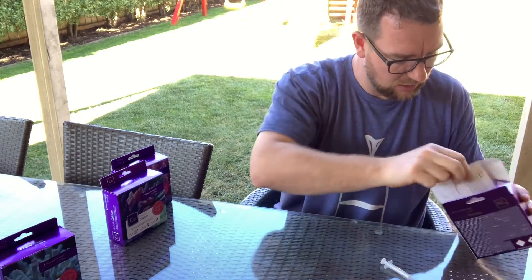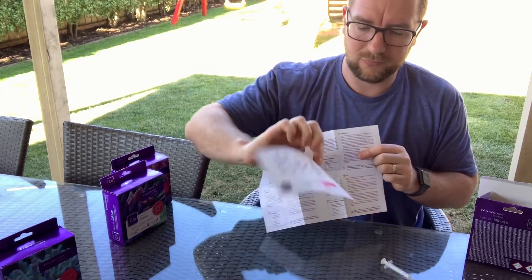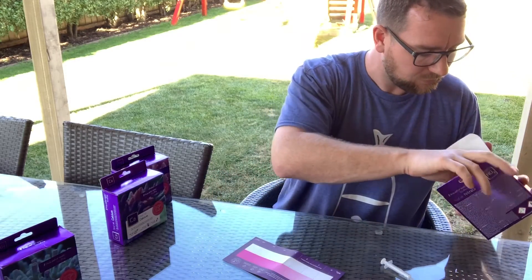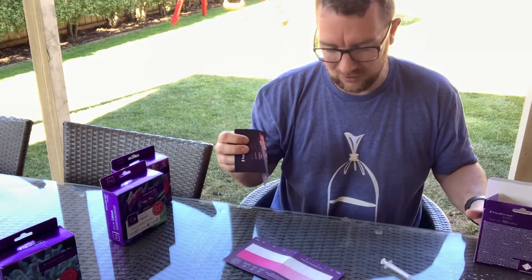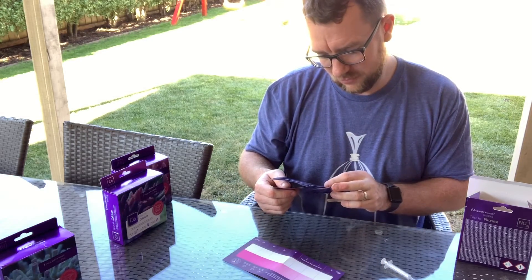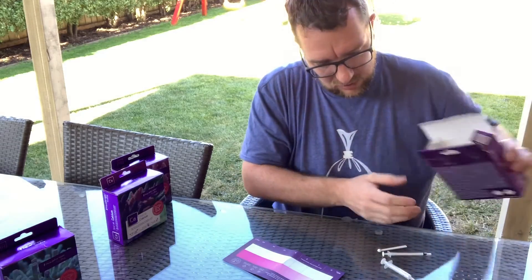We also get some paraphernalia — full written instructions, though I'll just use the handy card. There's also a little spiel about their NitroPhosMinusMinus product, which is kind of ironic since it's a nitrate test kit. So if you're struggling with nitrate, you can dose NitrophosMinus, and there are other details about their other products.